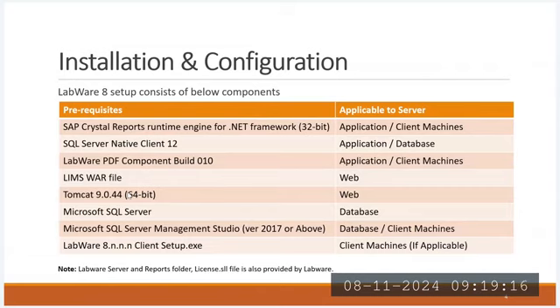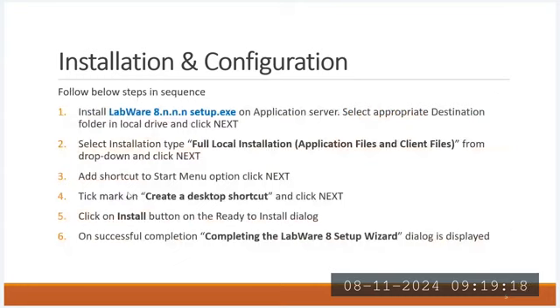While performing installations, there are some procedures: how to start the installation, where I have to install, and after installation, how to make desktop shortcut apps on our laptops or local systems. We are going to discuss all that information thoroughly.